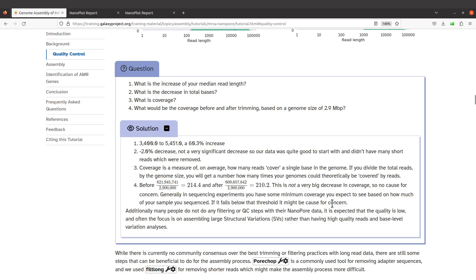Comparing coverage before and after filtering, the difference is not much — 214.4 versus 210.2 — so we shouldn't be worried about downstream analysis with respect to coverage. It's also possible to compute coverage yourself using Python, R, or even Bash. Try your hands on that and leave comments or feedback. If you want to do that later, you can contact me and we can arrange a session to do it together.